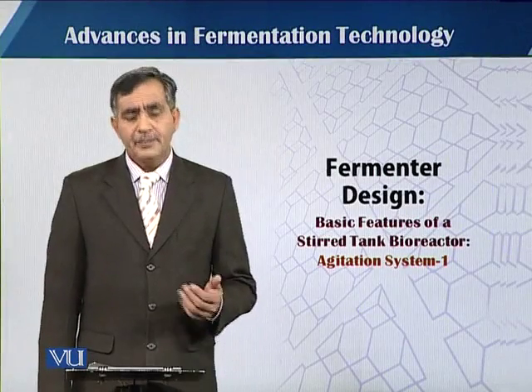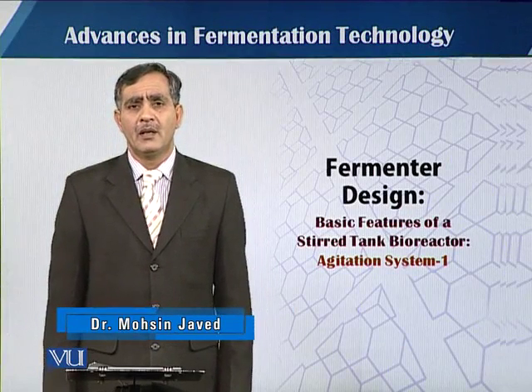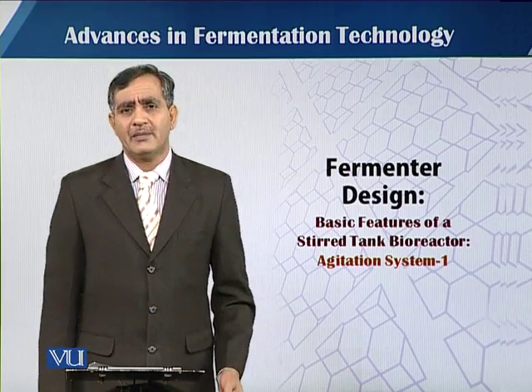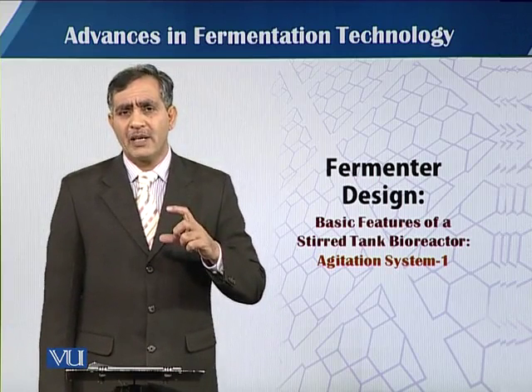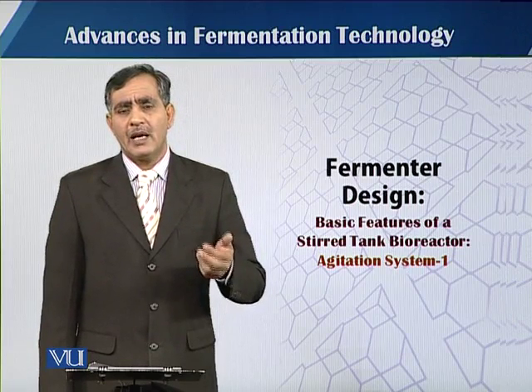In this module, we will talk about the second important feature of the stirred fermenter. While talking about the basic parts of a stirred fermenter in that module, we have seen the body vessel, agitator or agitation system, and a sparger.